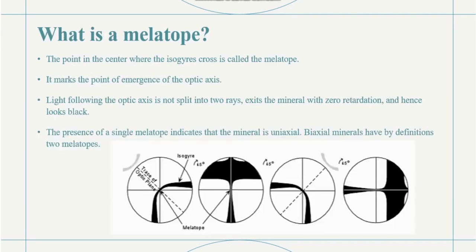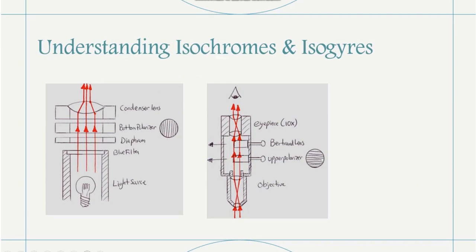Let me quickly show you. You need to open the aperture of the diaphragm, and you also need these condenser lenses, and obviously you need the light source. So you need the light source, the diaphragm, the condenser lenses, and of course the objective lenses.